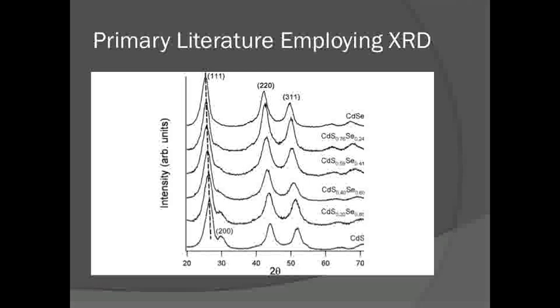One conclusion the researchers reached was the sulfur-rich seeds found in the nanocrystals do not affect the size and composition of nanocrystals. This means that all nanocrystals larger than the sulfur seeds are considered homogeneous, which is supported by their X-ray diffraction spectra.